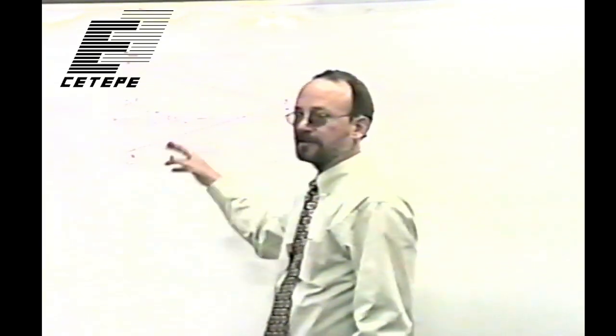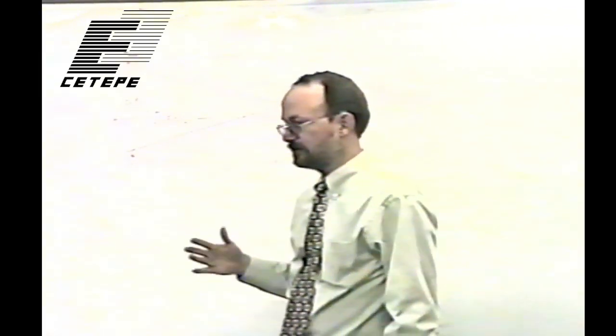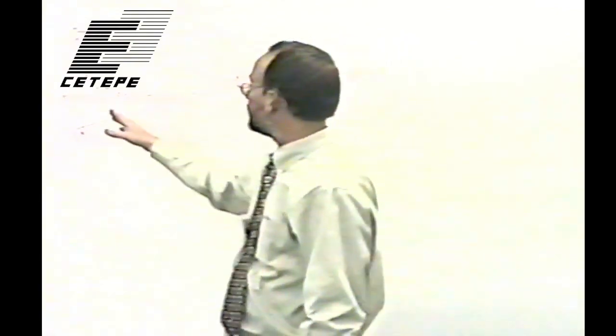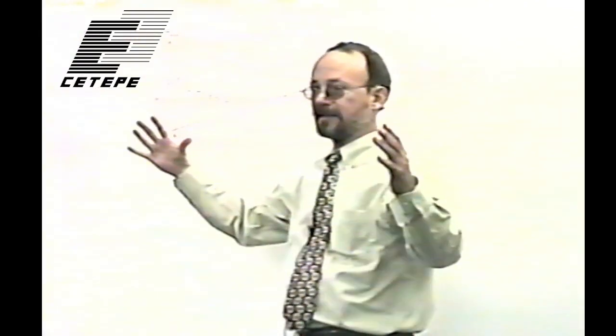But much more important in most cases is this very high voltage. So the electrons just gain a lot of kinetic energy and produce a lot of light in the output. And one of the things, I don't think we need to go through it, because it's not key to the class. But in the handout yesterday, on the last page, I mentioned these quanta diagrams. And you'll see what I'm talking about for an image intensifier, where you have a few X-rays coming in, then you get this huge gain, and then you get many, many light photons. Then the charts dip down.